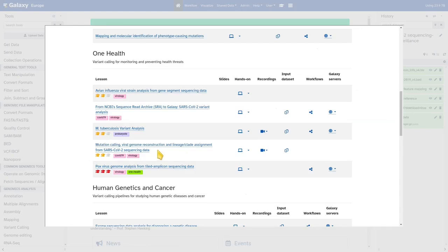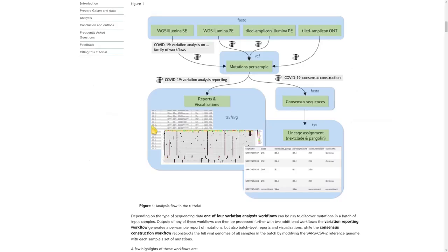Here is a brief outline of what we're going to do. We're going to run a sequence of production-ready workflows that can be used to perform a full SARS-CoV-2 sequencing data analysis, complete from raw sequence reads up to quality control reports and consensus sequences of the viral genomes. The analysis works with complete batches of samples, like they would come out of real-world genome surveillance projects. We'll look at reports and visualizations at both the sample and batch level, and do lineage assignment using Nextclade and Pangolin.